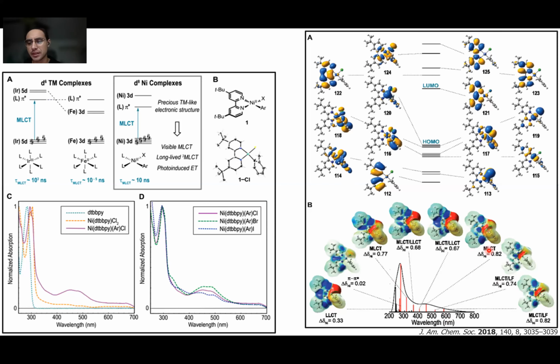They've also calculated the charge density. So this delta nickel is just talking about the difference between nickel 2 and nickel 3 in these excited state transitions. They've also generated a nice molecular orbital picture here with these calculations, and also important to note that this calculated spectrum agrees quite well with the experimental spectrum.